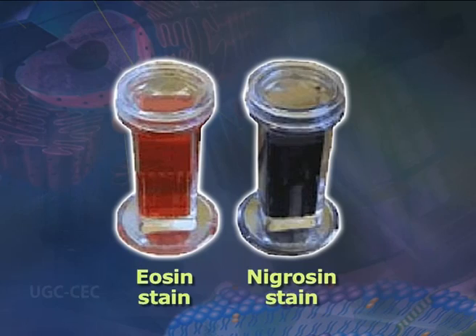Microscope slides and nigrosin eosin stain should be pre-warmed to body temperature. Pipette a drop of stain onto the end of a slide and then pipette a small droplet of semen next to the stain. Place the edge of another slide into the drops of stain and semen. Rock that slide back and forth a few times to mix the sperm and stain. Then smear the second slide across the surface of the first.